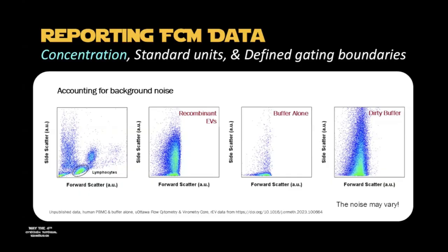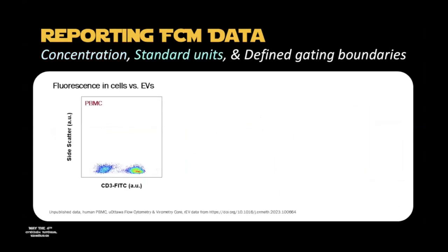So keep in mind, if you're reporting in percentage, these events will all get counted into that percentage, and therefore make your percentages not as accurate as you would like. Hopefully that has given you some food for thought about reporting in percentages.